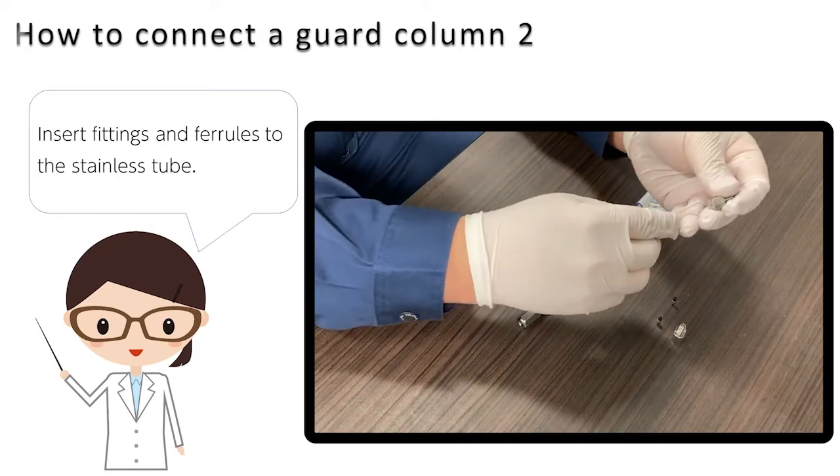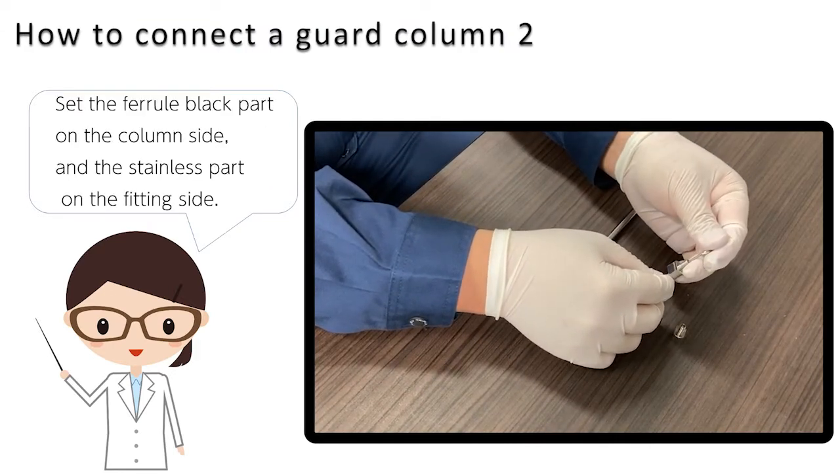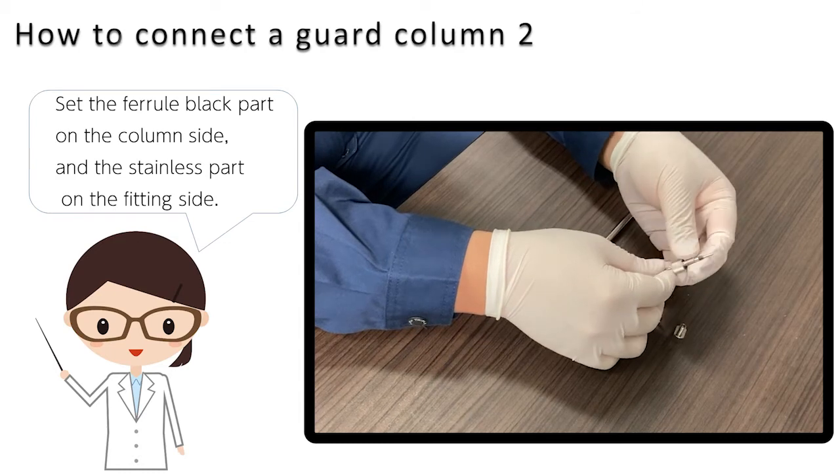Insert fittings and ferrules to the stainless tube. Set the ferrule black part on the column side and the stainless part on the fitting side.